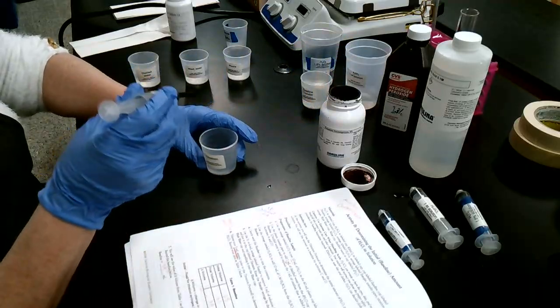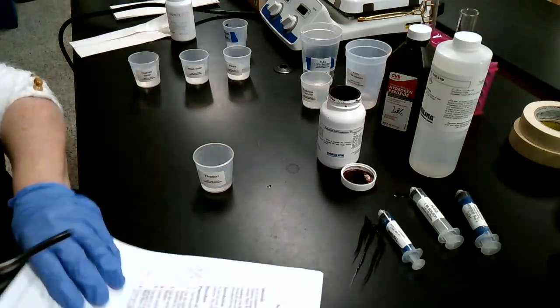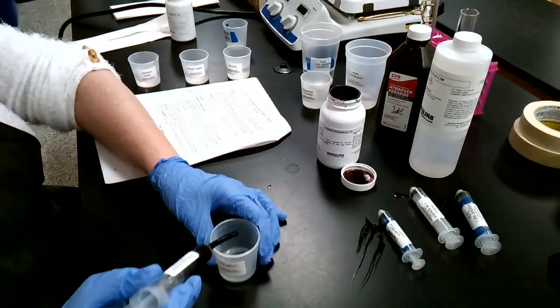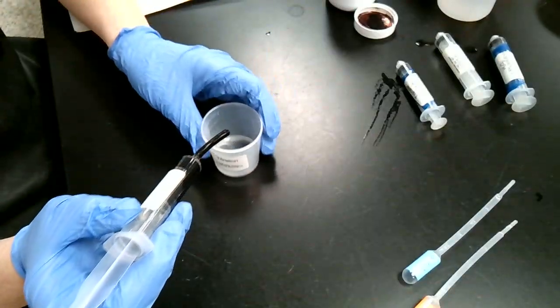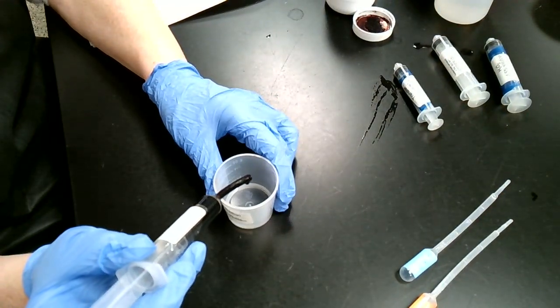titration process happens. What I'm going to do is I'm slowly going to add. And I think I want to get this a little closer. Switch this with this here. Okay. Because I want you to be able to see in the cup. Let me kind of tilt this down a little too. I want you to watch in the cup what happens here. Okay. So I'm going to put a drop in, right?